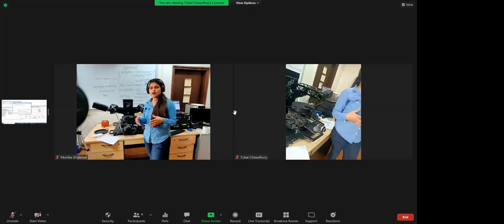In a simple way, none of us is working on thin films, so we have no new sample with us. We planned for that also, but due to COVID in Pune, the IISER and NCL both are locked. Even we came with special permission, so it's not possible for us to make a new sample and demonstrate with a model. But yes, I will demonstrate other than these samples.